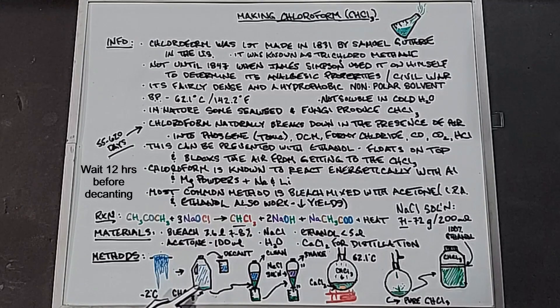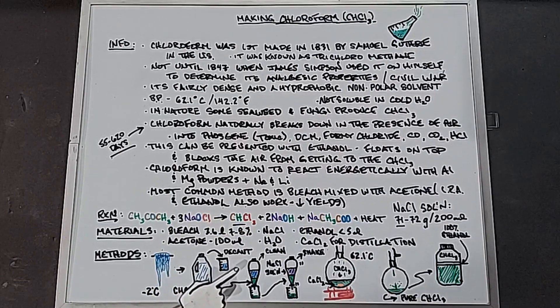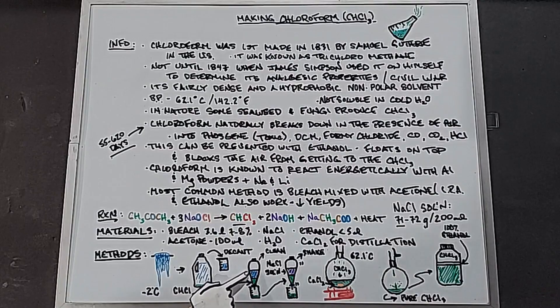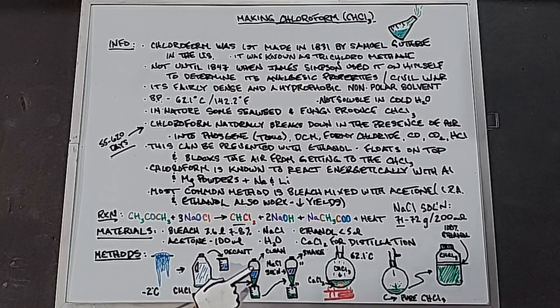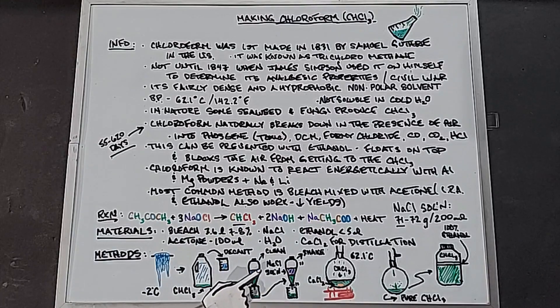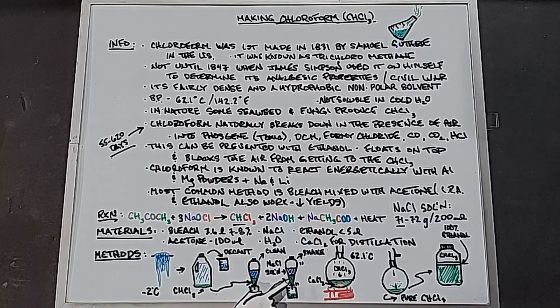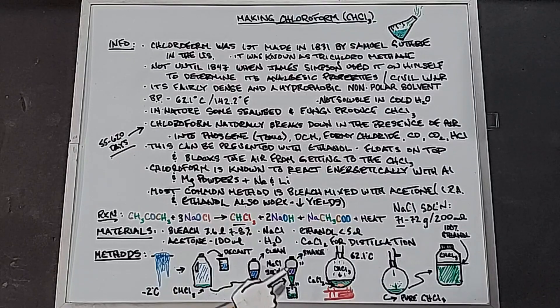You're left with just a little bit that can fit both the remaining liquid and the chloroform into your separatory funnel. In your separatory funnel, you want to drip out your chloroform on the bottom, toss the rest, dispose of it properly, and then clean this up. Once you clean up your separatory funnel, put your chloroform back in, and in comes a sodium chloride solution that you're going to mix by shaking. You're going to absorb out of the chloroform some water, most of it actually, and then any salts that are also mixed in there, so you have a pretty darn pure bit of chloroform at the bottom.